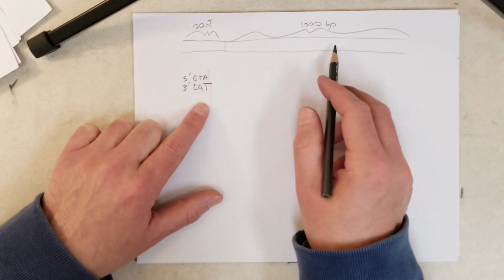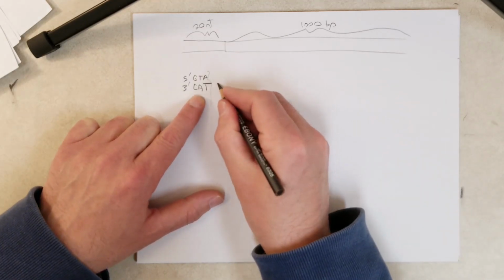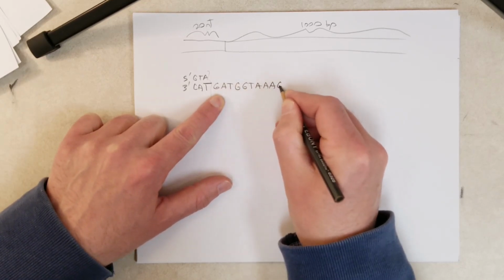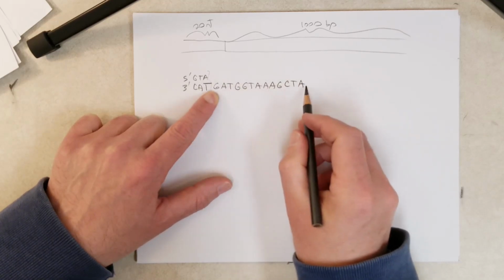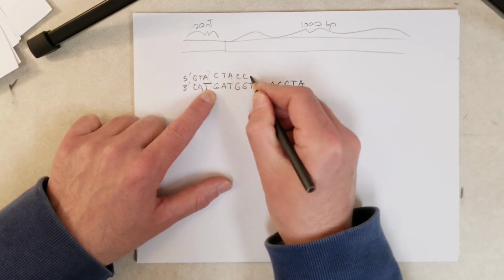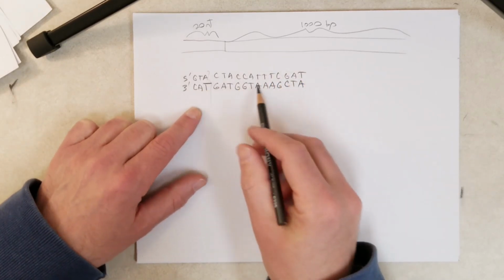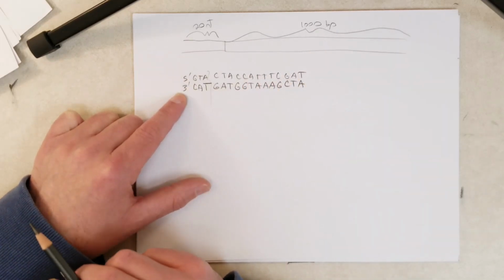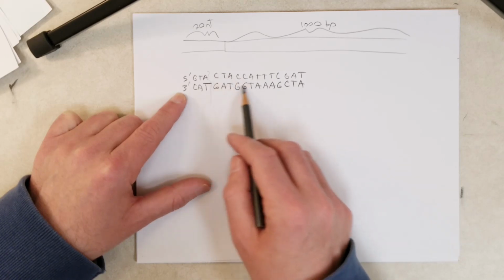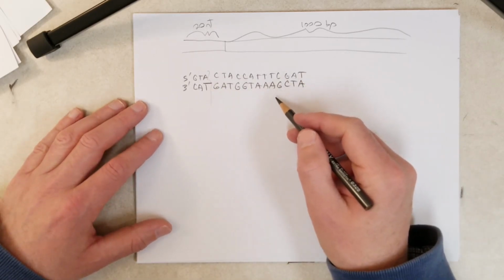And for the unknown, we're going to pretend we know it, right? We're going to pretend we know it so I can teach you how Sanger sequencing works. So there's the unknown sequence, unknown in quotation marks, right? And this is the top strand. Now it's pretty short, but let's imagine it's 1,000 base pairs long. And we don't know the sequence, but for me teaching you how Sanger sequencing works, we'll secretly know that this is the sequence.